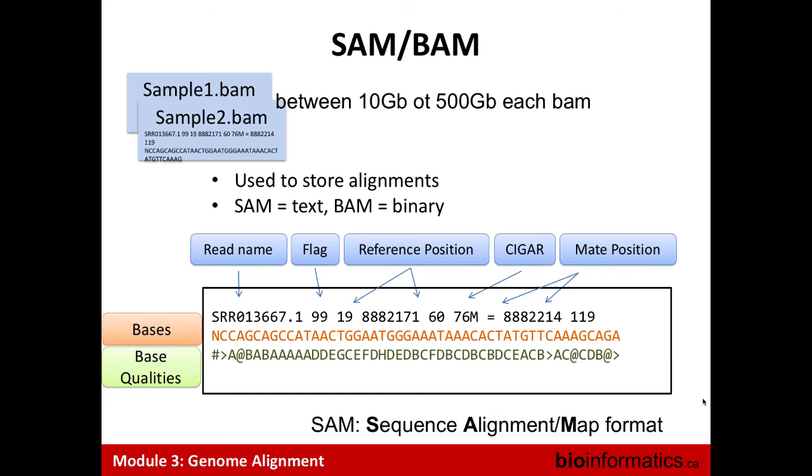76 and 76 matched. Yes. Yeah. The first base pair is an N? Yeah. It probably means that when the sequencer was run, it didn't arrive at a quality base. So I put it there. And as we do the trimming from the end, if the quality was going up there, then look at that. So that's why the end stayed in the sequence.